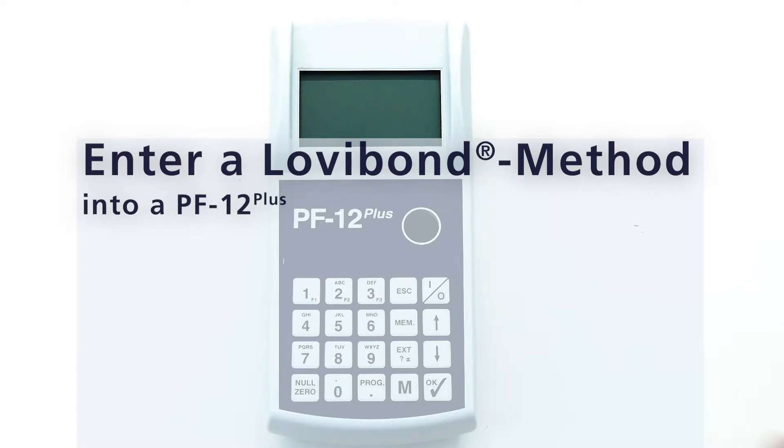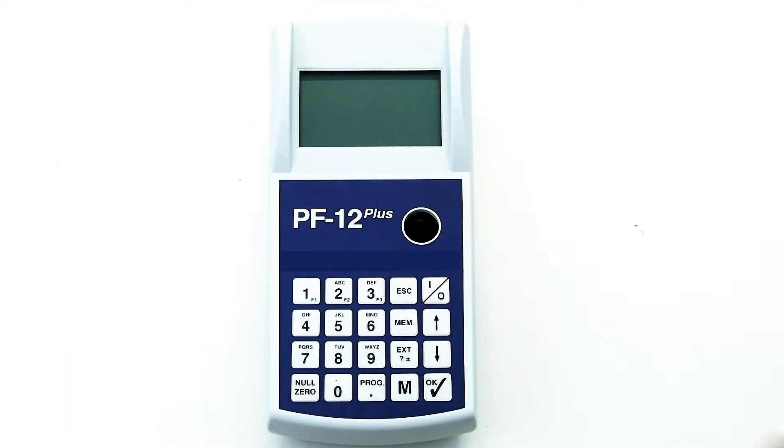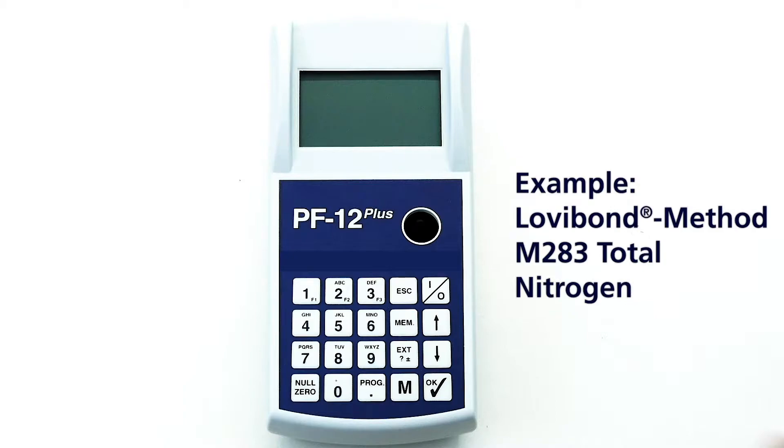Hello, I am here to guide you how you can enter a Lovibond method into a PF12 plus photometer. We will take Lovibond method 283 for total nitrogen as an example.